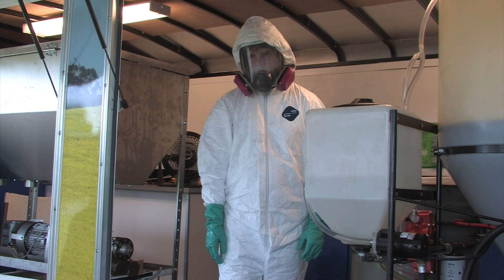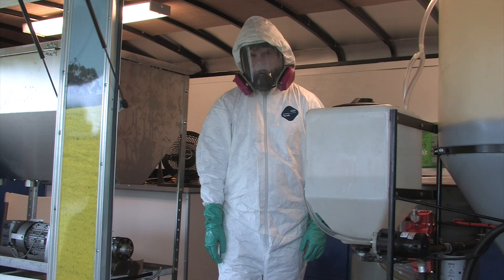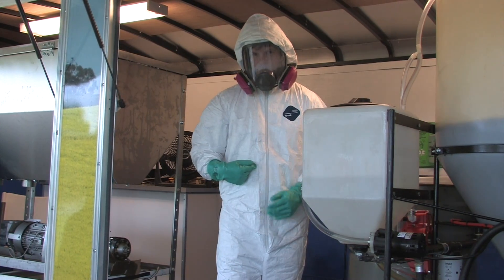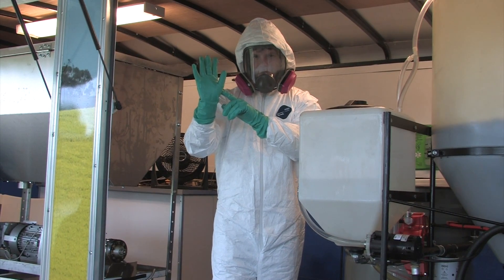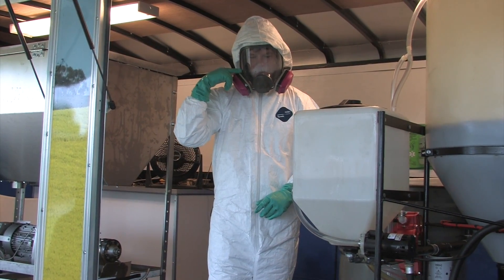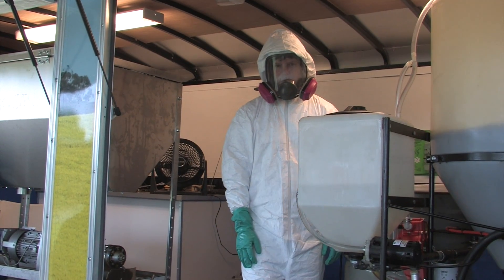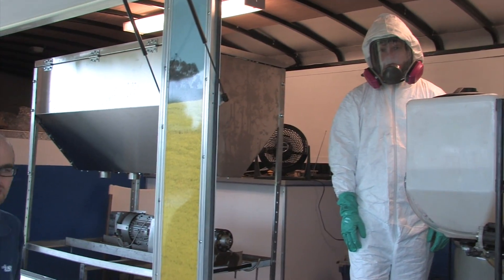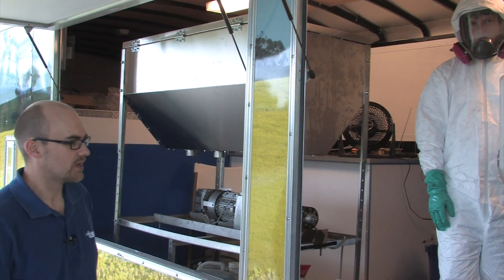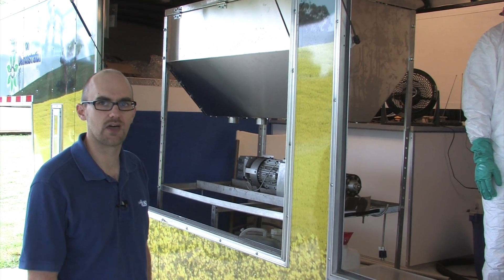You'll notice that Richard's wearing the proper protective equipment. He's got his Tyvek suit, his rubber gloves, and his respirator. Behind him we've got a fan going and our trailer opened up, and that's going to provide plenty of ventilation so that there's no issues from either the methanol or from the potassium hydroxide that we're using.